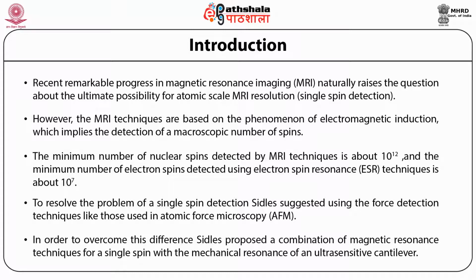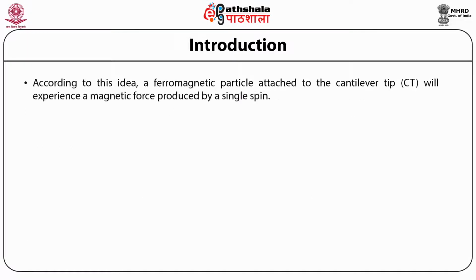In order to overcome this difference, Sidles proposed a combination of magnetic resonance techniques for a single spin with the mechanical resonance of an ultra-sensitive cantilever. According to this idea, a ferromagnetic particle attached to the cantilever tip will experience a magnetic force produced by a single spin.